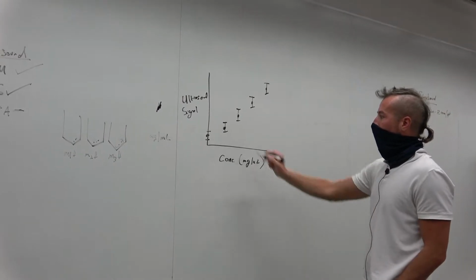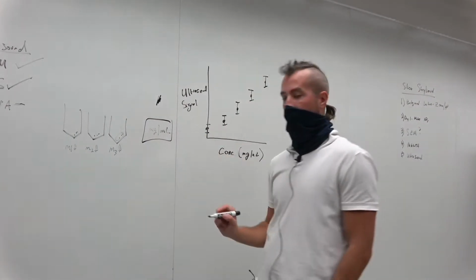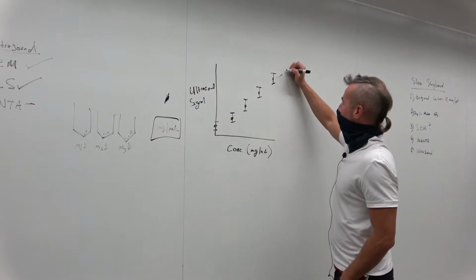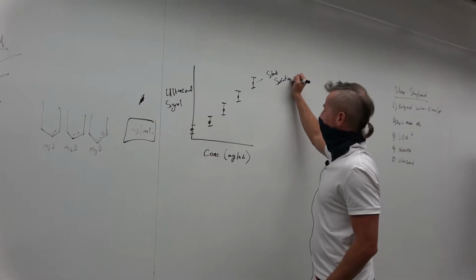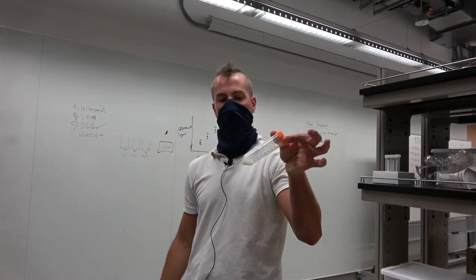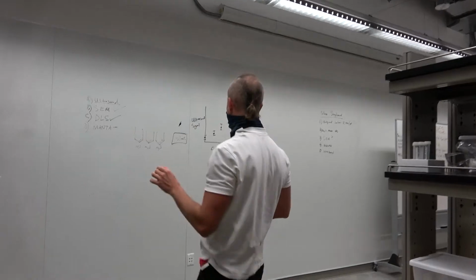Okay? So what are these concentrations? Well, that's the first calculation you're going to have to do, right? By knowing the final mass, you're going to know this concentration. This is the concentration of your stock solution. So remember this big tube from yesterday? It's the concentration that was in this tube, right? This is the sample that we sonicated and resuspended. We centrifuged it before that. So this is your highest concentration.